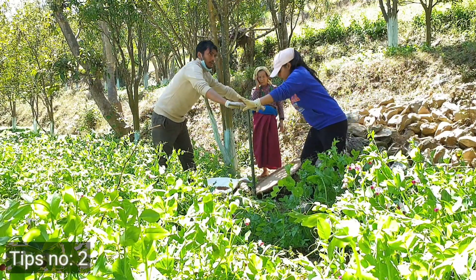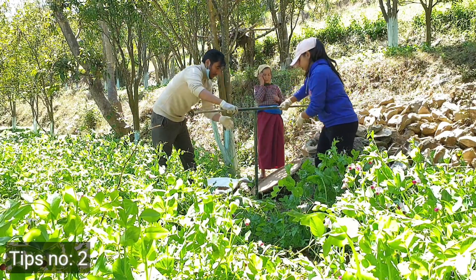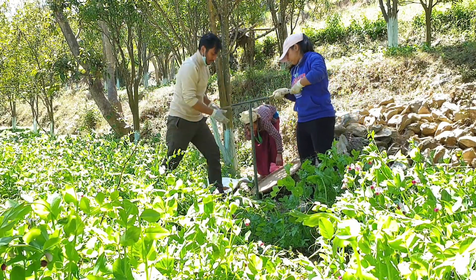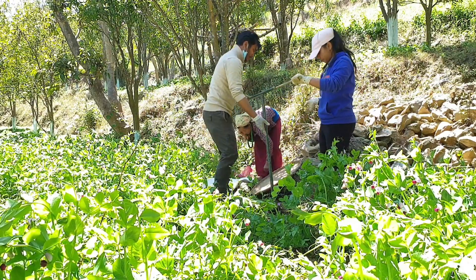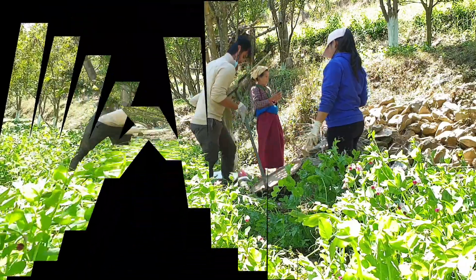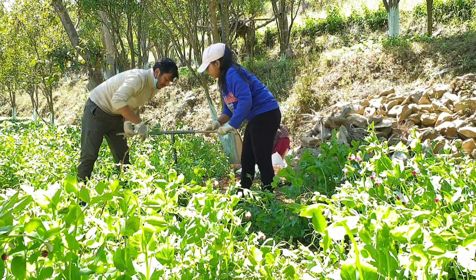Tip number two: when taking the sample, if you go all the way deep to 2 feet without stopping, you cannot pull up the auger. So at the midpoint you should pull up the auger and remove the unsampled soil from the auger outside. Then re-insert the auger into the soil down to 2 feet.